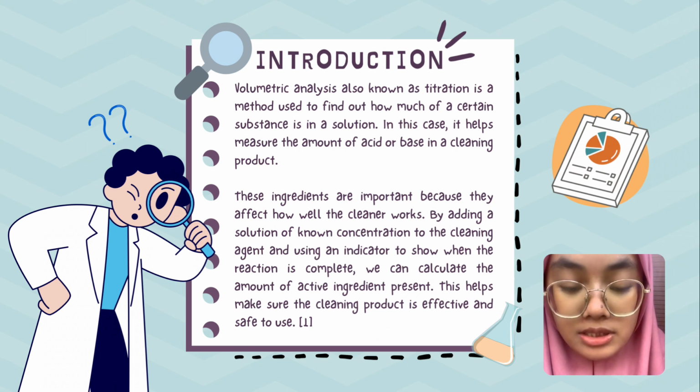In summary, volumetric analysis is a reliable and accurate technique used in quality control to test the strength and safety of cleaning products. It combines chemistry with careful measurement to make sure consumers are using products that do their job well without causing damage or risk.